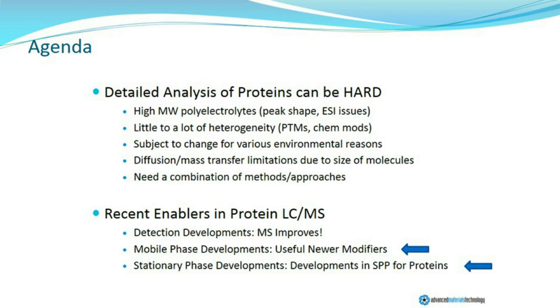So, predominantly as a consequence of the higher molecular weight of the analytes, we can refer to what I'll mention in today's discussion as diffusional or mass transfer limitations, which reflect the size of the analytes of interest. That is to say, when you get an increase in molecular weight, that is larger molecules, they don't diffuse through free solution as quickly as small molecules. And this is generally reflected in the conditions and materials of use that are required for liquid phase separations.